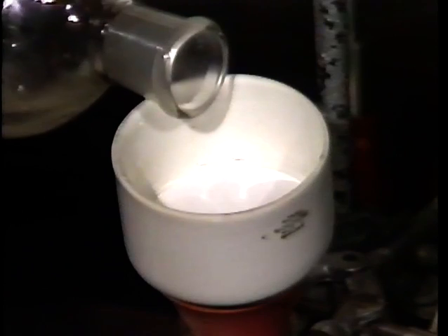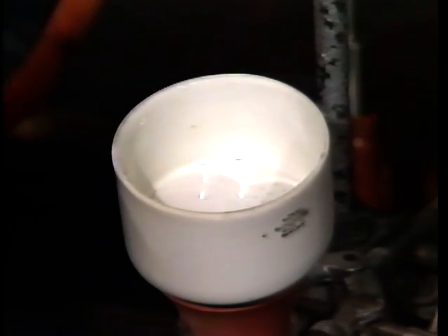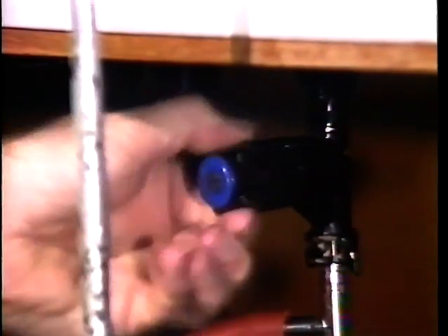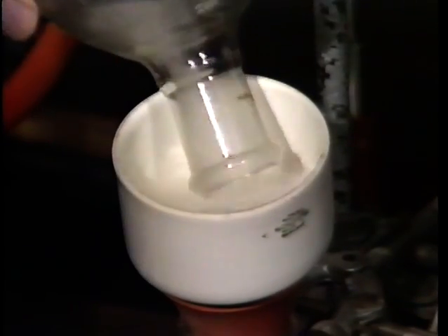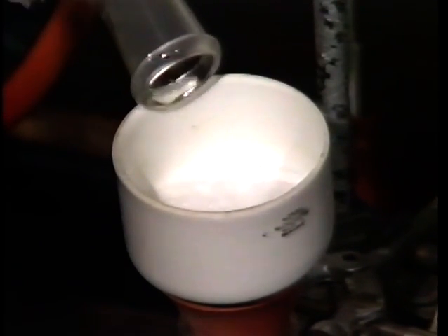Pour a little of the supernatant of the recrystallization onto the filter paper in order to damp it and to fix it to the bottom of the funnel. Turn on the water pump and transfer the mixture, with shaking, to the funnel, ensuring that as many of the crystals go into the funnel as possible.